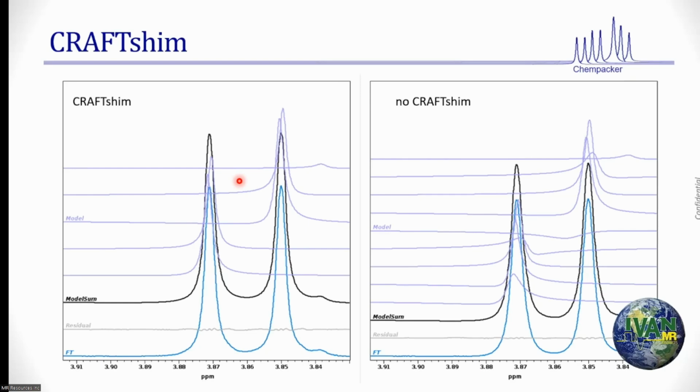But the fact is, now if you think about mathematically fitting a high resolution spectrum into a quantum mechanical model, and then use that to simulate a low field spectrum, the input can be this, not this. Now that doublet information is provided to that quantum mechanical model. So you have a higher resolution, a potential opportunity to improve things that you are typically used to. You assume it's a doublet. Your FT tells me it's a doublet. I'm saying that it is actually a doublet of a doublet. The information exists. Use this information in any other methodology.